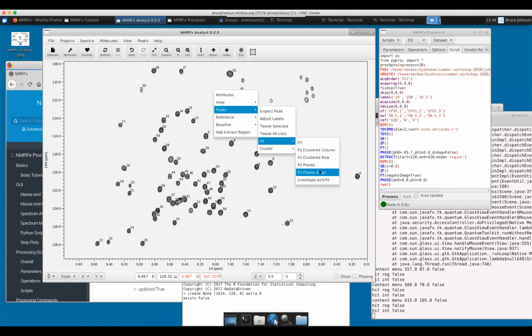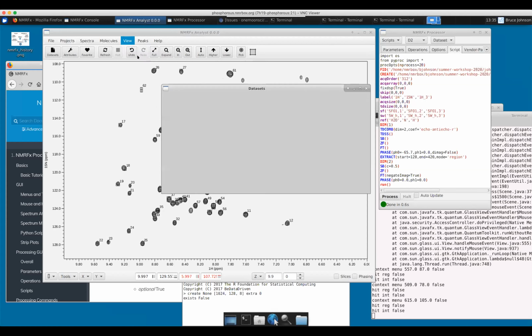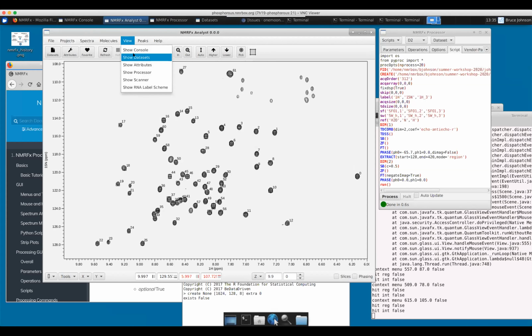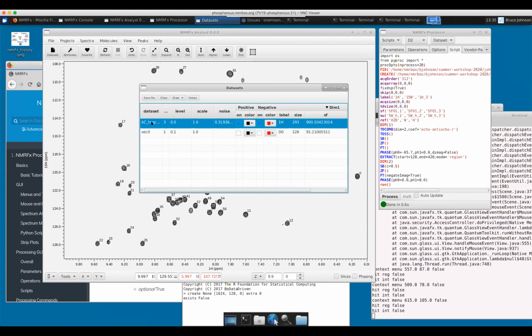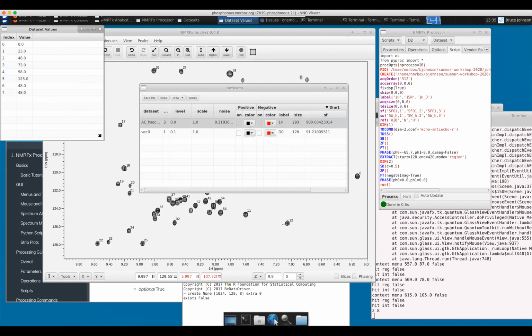That method, and the plotting that method relies on, actually needs correct relaxation delay times for these peaks. That can be a little bit tricky with these data sets. If I pull up this, I went to view, show data sets, I have this little viewer here, and it has a little button here to show the values that go along with this data set.